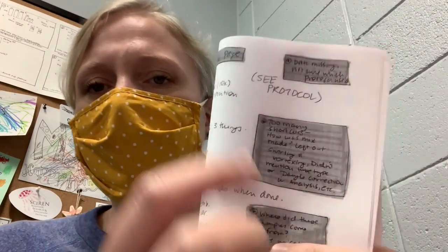Or sometimes people just say, see protocol. I did it like the protocol. Well, of course you didn't do it exactly like the protocol. Lots of our protocols say from 1 to 2 hours. So you need to write this down so that we know exactly what you did.